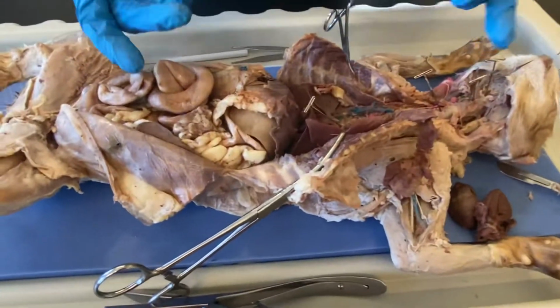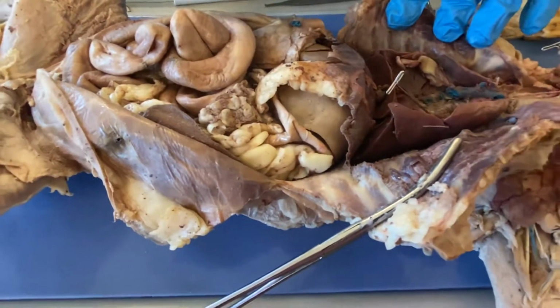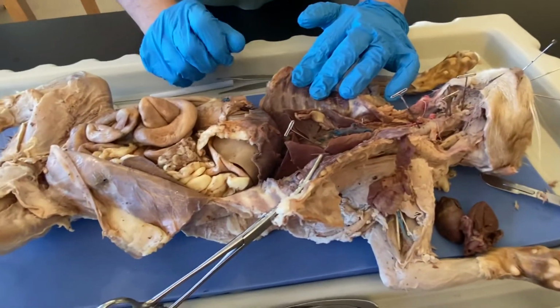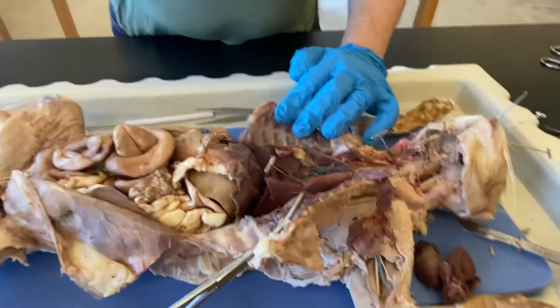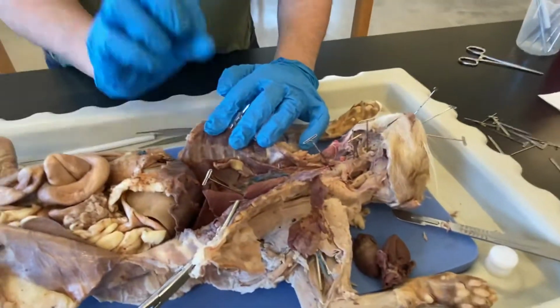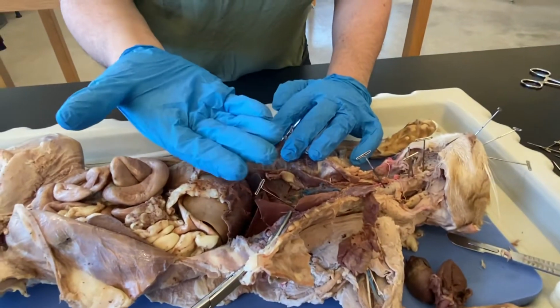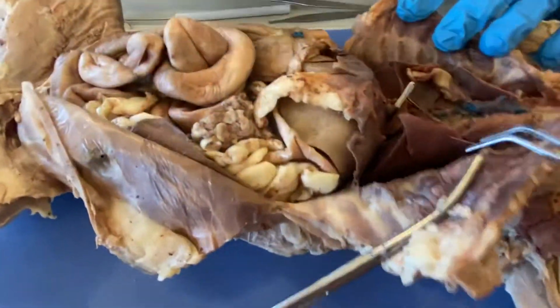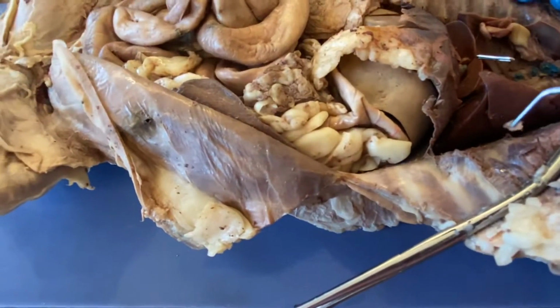Alrighty, and then that brings us to our parietal and visceral pleura. Little bit difficult to find on this cat, I think maybe just because of the way we did the dissection and it's been a while. But the way to know it is that the parietal pleura will go around the thoracic cage. They are superior to the visceral pleura, which goes directly around the organ, and it's the inside layer, so to speak, of the parietal layer, and it's on the surface of the lungs, which allows that lovely low to high, high to low.